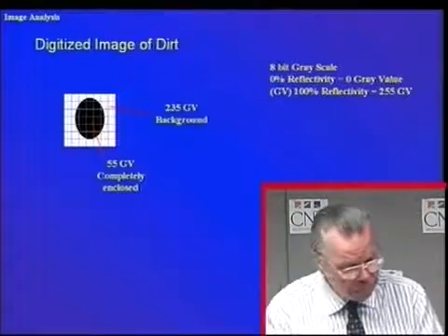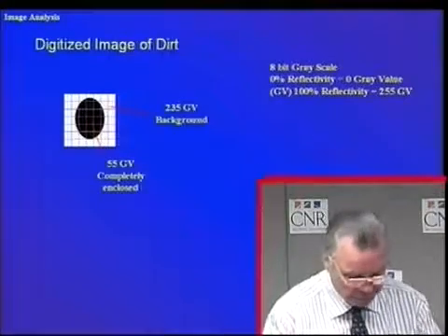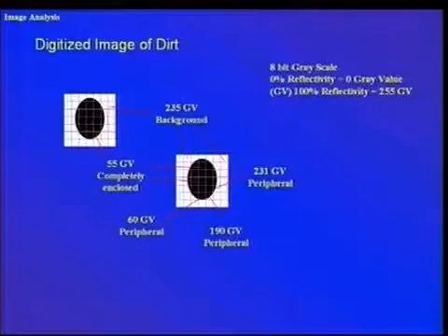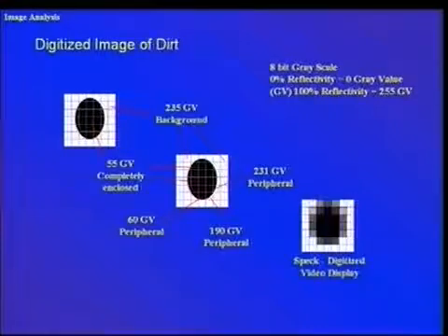But you notice one peculiar thing about this. The image is not completely covered, or the sensor does not completely resolve or obtain an image of the edge of the dot. This edge effect ends up in the image as a gray value that is not really representative of the spec itself.